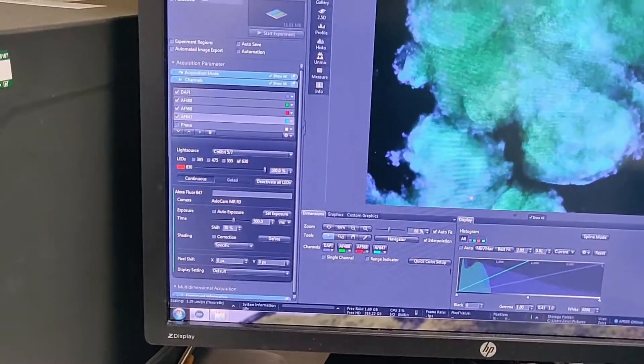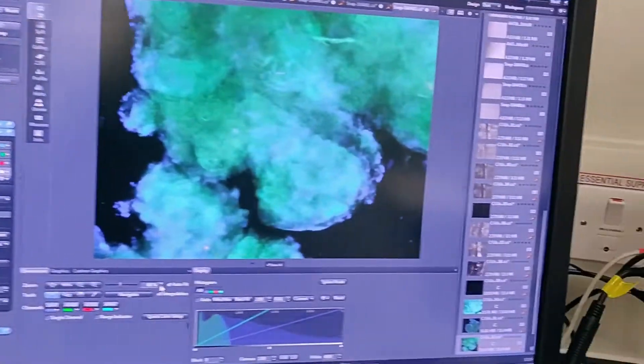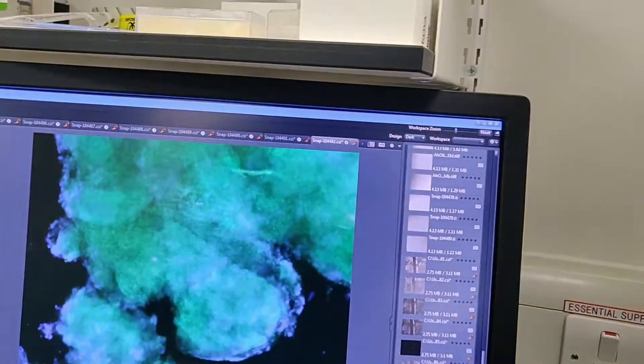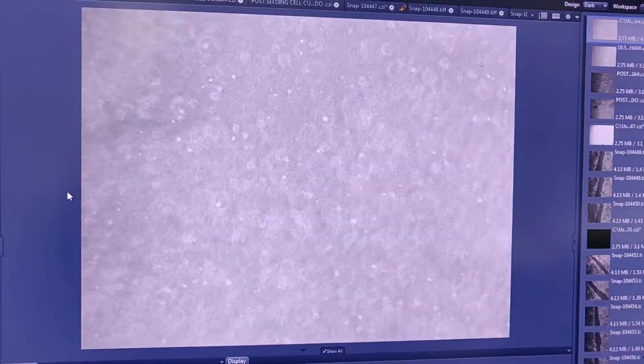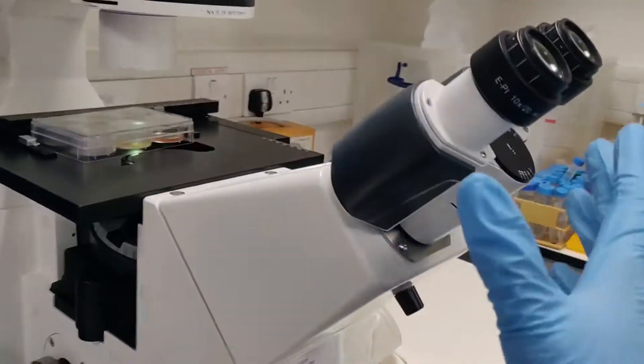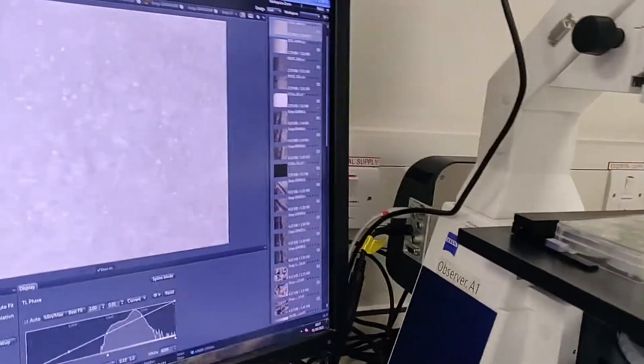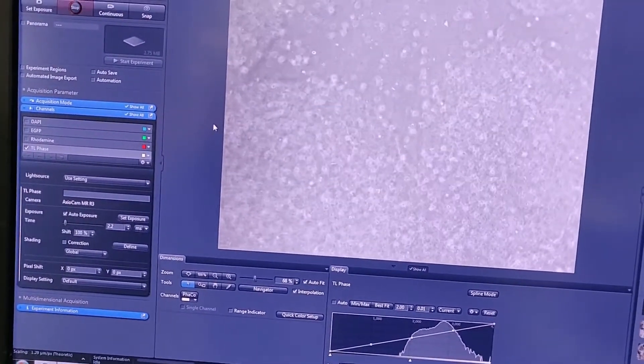So, here we go. I have just adjusted by looking through the eye which is much easier than looking at the computer screen. So, now let's look under the microscope how they are going to look. And then they are going live. So, basically, this camera, you can see through the camera, you can see through the eyepieces and it's much easier for me to adjust through the eyepieces than through the screen. But whatever you can see through the eyepieces, it can be projected through this camera to the computer screen. And then it looks much bigger and basically it's to take photos.